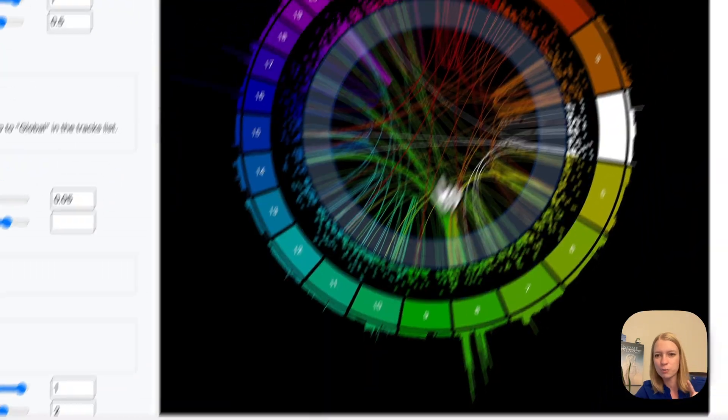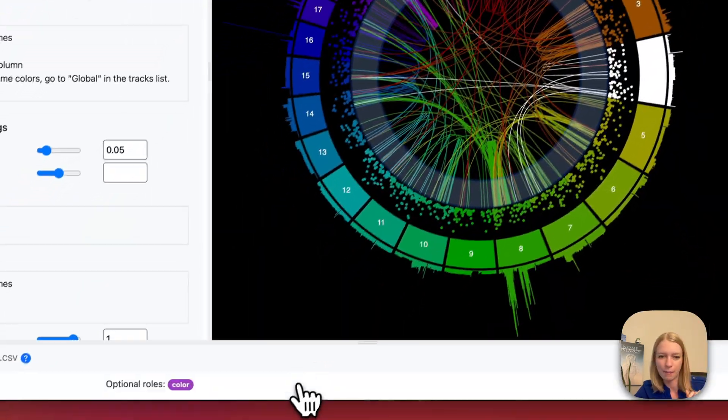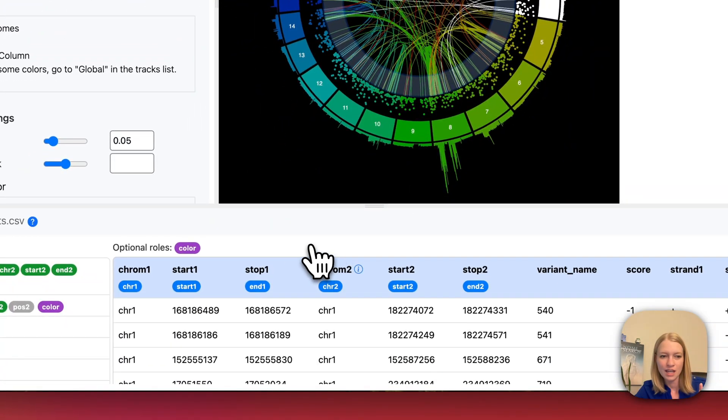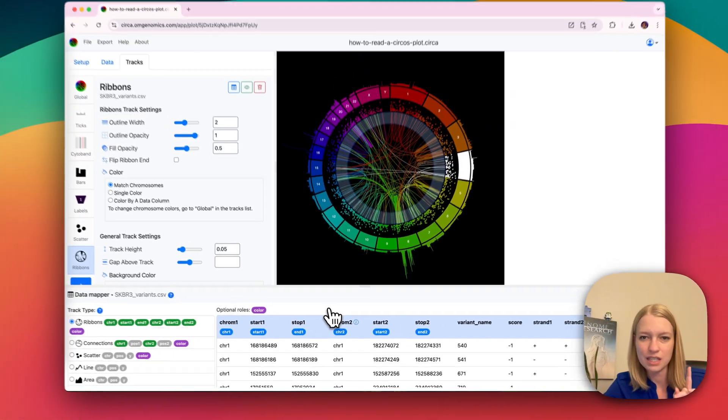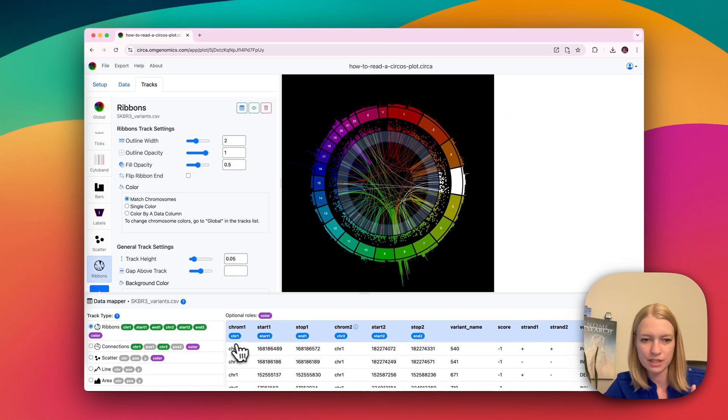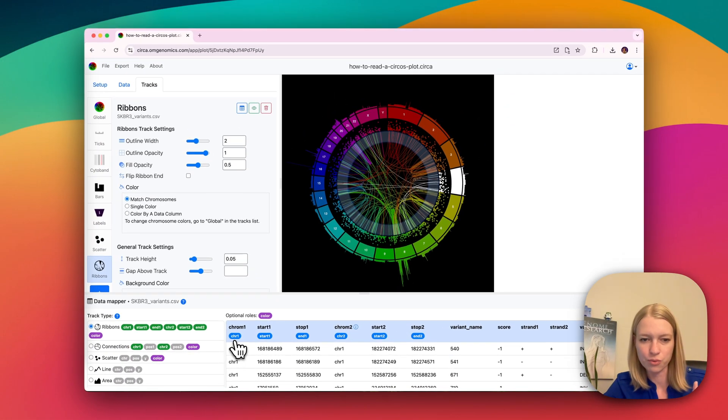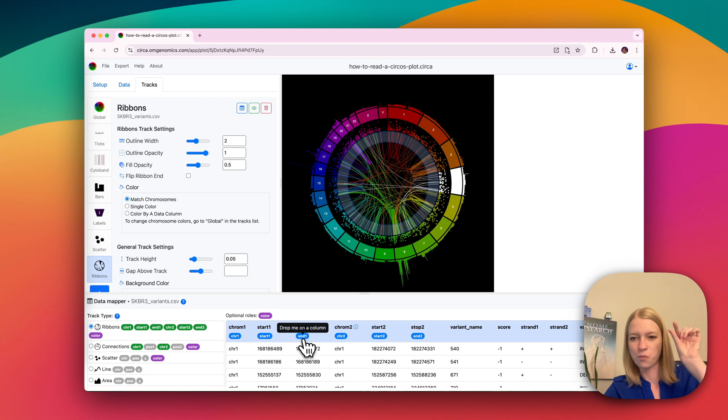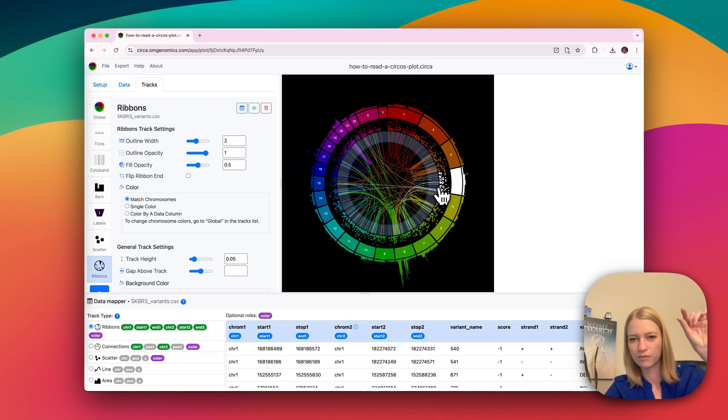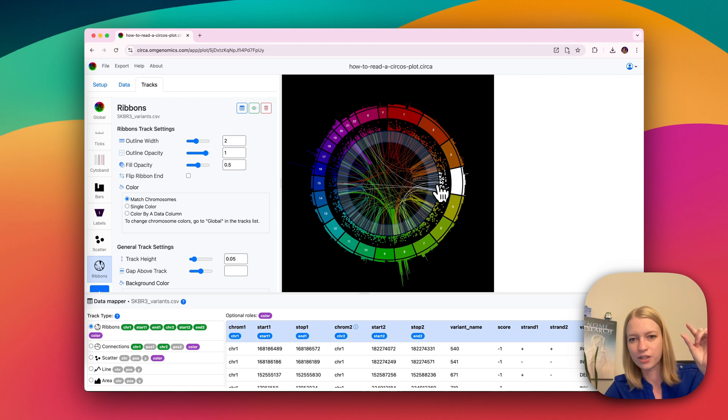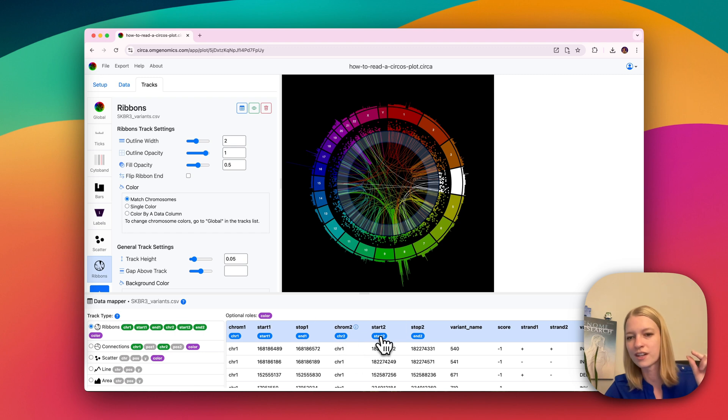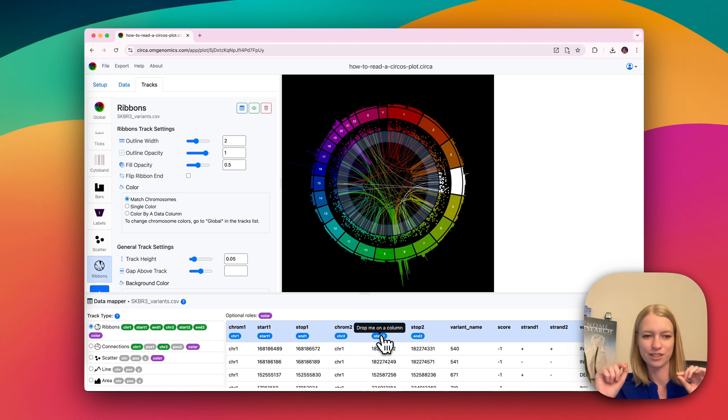If I actually open the data mapper for this one, you can see that these are ribbons that have a chromosome one, start one, end one. So that defines one side, which could for instance, be on chromosome four here in white. And then it could connect over to chromosome seven, which you would see as chromosome two over here with its own start and end positions.